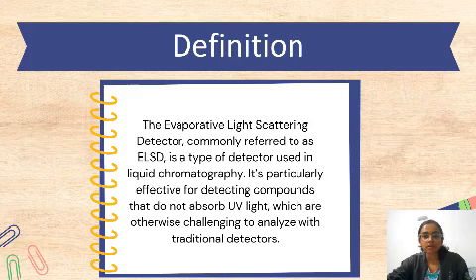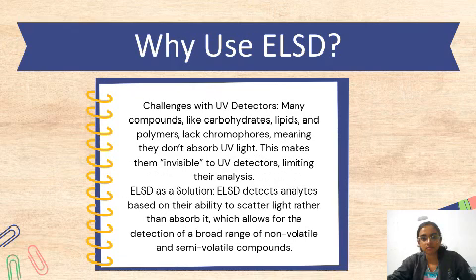The evaporative light scattering detector, commonly referred to as ELSD, is a type of detector used in liquid chromatography. It's particularly effective for detecting compounds that do not absorb UV light, which are otherwise challenging to analyze with traditional detectors. Why use ELSD? Challenges with UV detectors.